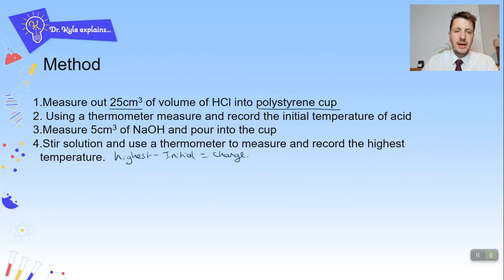Okay. Now, again, why do you wait for the highest temperature? You want to essentially do your reaction and then let that thermometer go all the way up. And when it stops, that's when you know the reaction is finished and complete, and then you can move on to your next measurement. You don't just want to stick your thermometer in quickly and then look at the reading and then move on. You want to wait until it reaches the highest point.